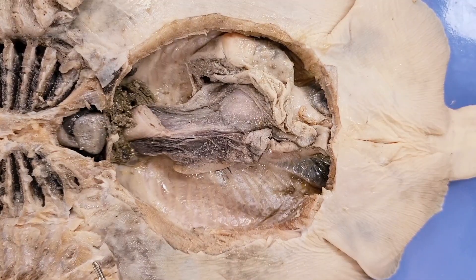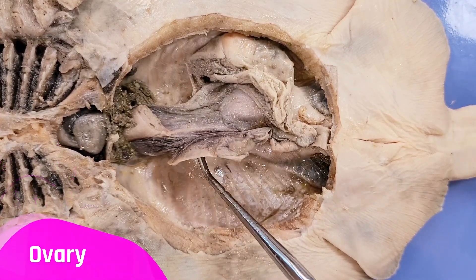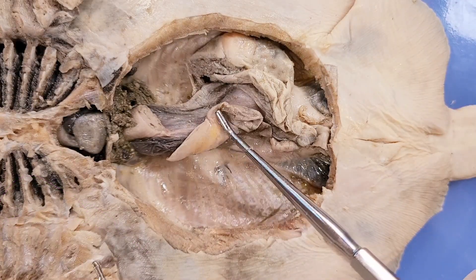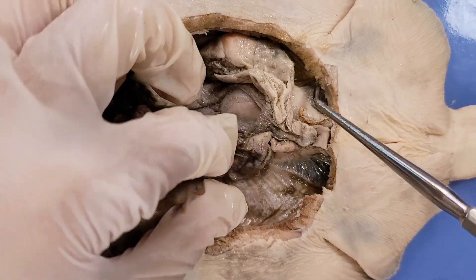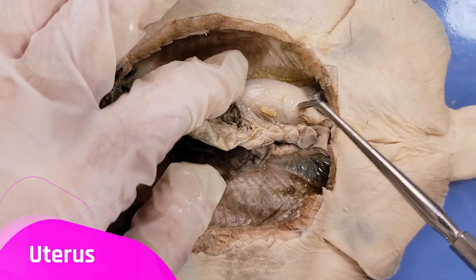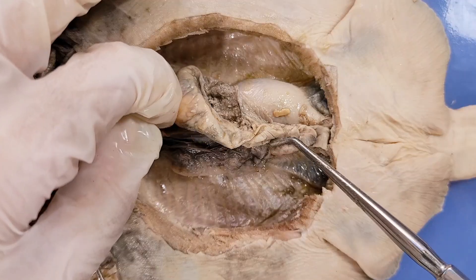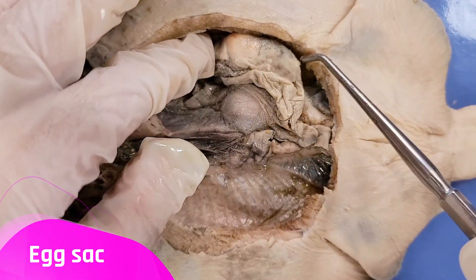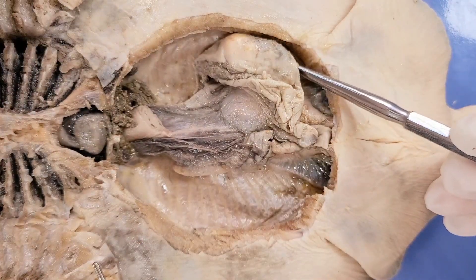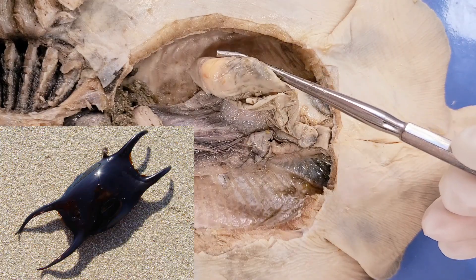Now let's look at the structures of the reproductive system. This is a female skate, so you can see an ovary right here. The ovary produces egg cells, which travel down the fallopian tube — right here — and into the uterus, which is here. The uterus is where the eggs get fertilized by sperm. Once the eggs are fertilized, the completed eggs move into the egg sac here. You can see an egg right there, and here the egg will develop into embryos inside so-called mermaid purses.